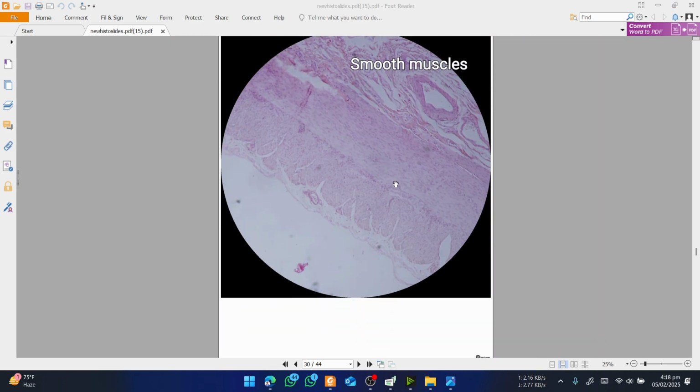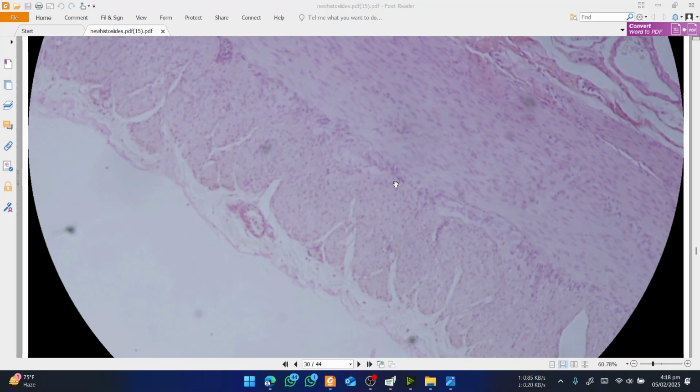And then there is smooth muscle. Smooth muscle cells are typically very small. These are spindle shaped cells like this, and if you see them in the longitudinal section, you will see a bunch of flattened nuclei irregularly placed in them. So this is the longitudinal section.